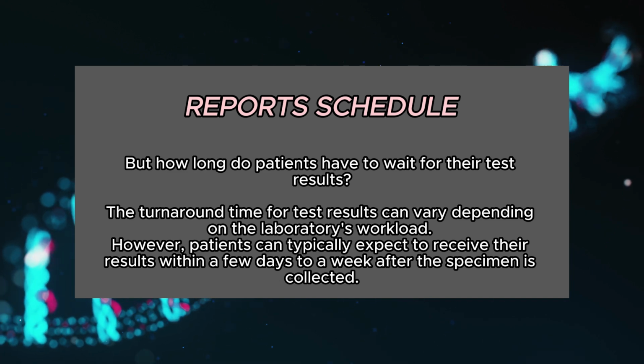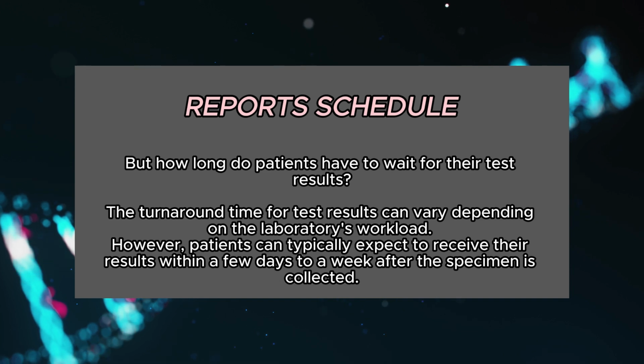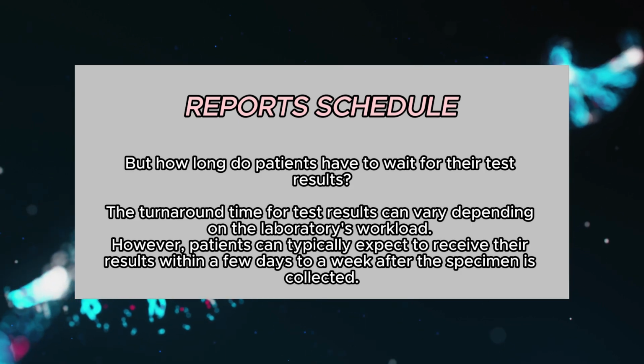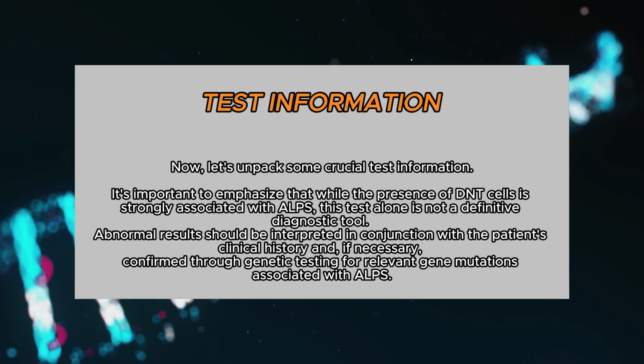The turnaround time for test results can vary depending on the laboratory's workload. However, patients can typically expect to receive their results within a few days to a week after the specimen is collected. Test information. Now, let's unpack some crucial test information.